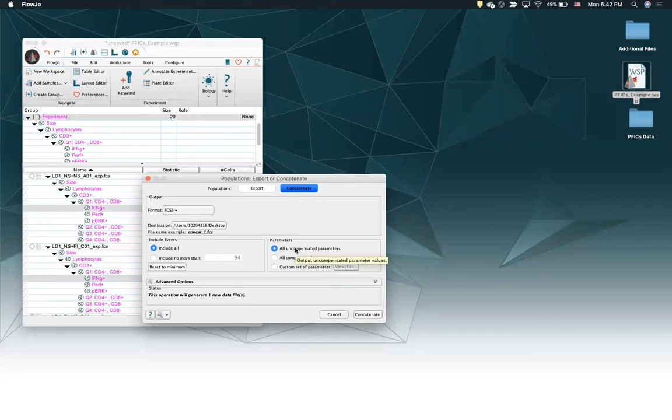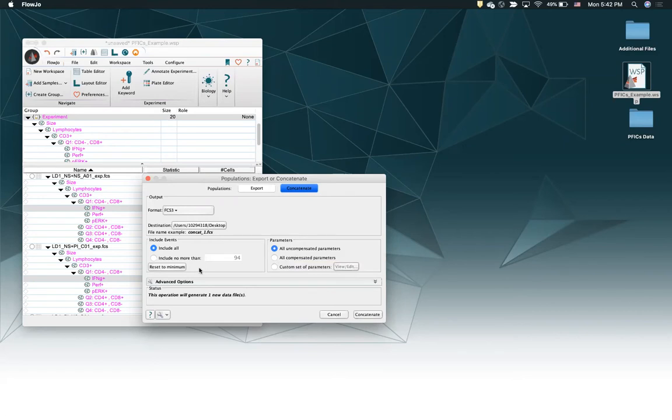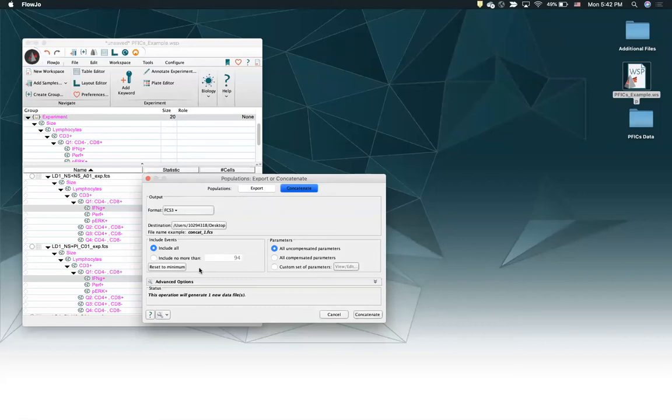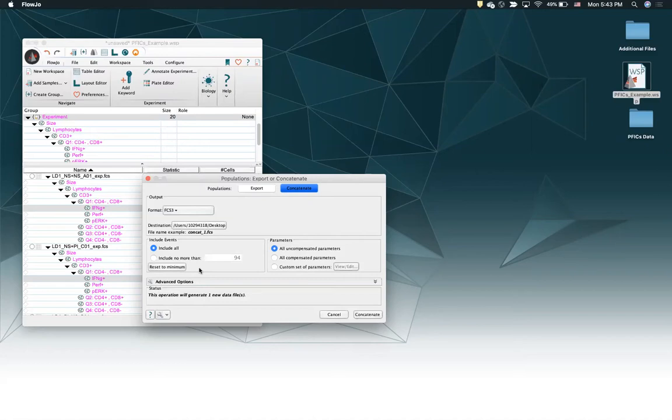First, I would normally advise concatenating with uncompensated parameters when the files that you're concatenating share a compensation matrix. So if all those files come from the same day or similar conditions such that their compensation matrices are the same or very similar, then it's usually appropriate to concatenate them using the uncompensated parameters. After you concatenate them, you can then apply that compensation matrix later to the concatenated sample that you just made.